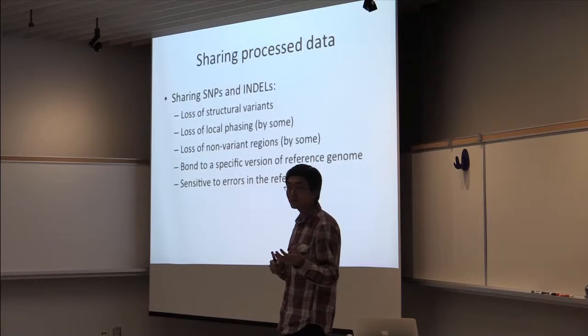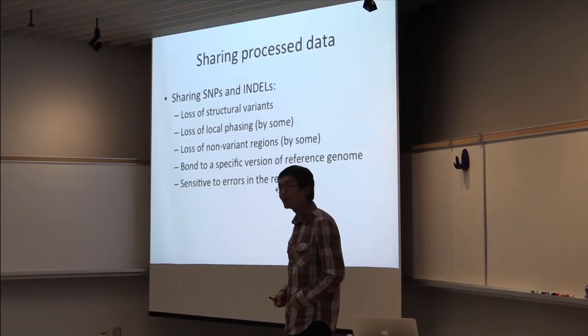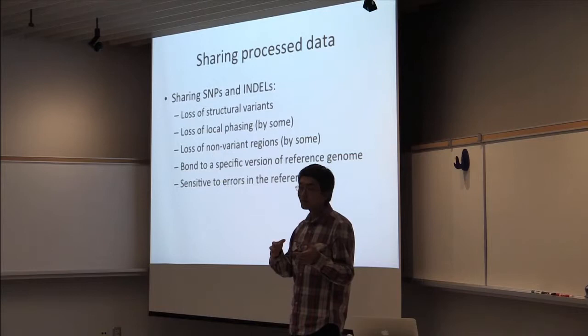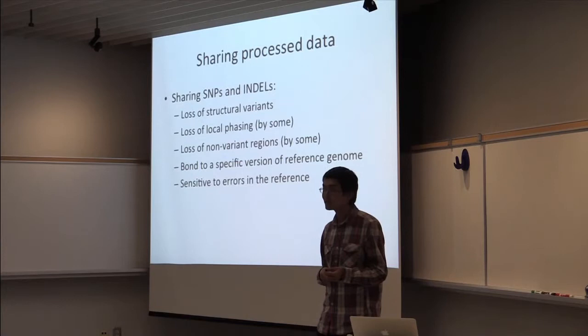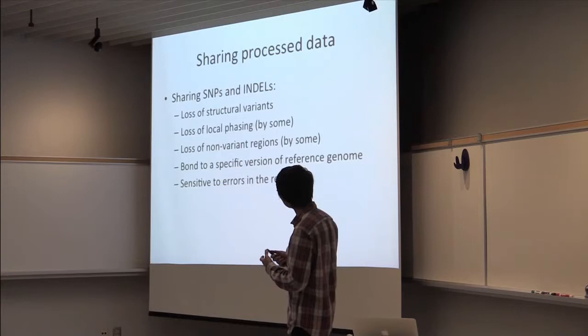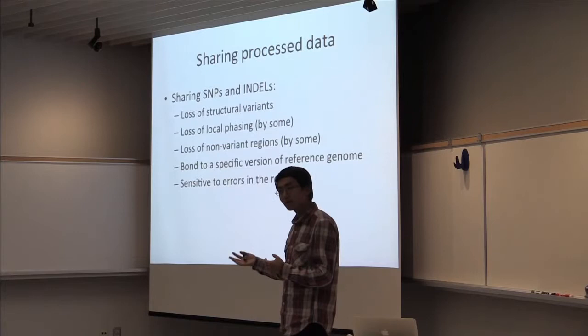And also there's a recent Nature Genetics publication from the Bioinformatics Institute. They basically did the de novo assembly of short reads, and they found that for the so-called Platinum Illumina data sets, which provide a call set, 25% of the SNPs and indels are missing from this sample. So we are not really at the stage where we are doing perfect SNP and indel calling. And in addition to SNPs and indels, there are structural variations, and there's phasing supporting libraries, and also the reference genome is incomplete, and maybe when the reference genome is updated, you will find more variations.